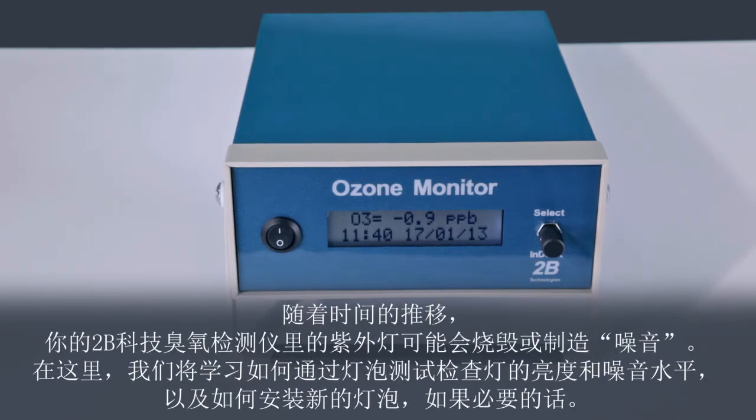Over time, the UV lamp in your 2BTEC OZO monitor may either burn out or become noisy. Here we will learn how to run the lamp test to check the lamp intensity and noise level, and how to install a new lamp if necessary.